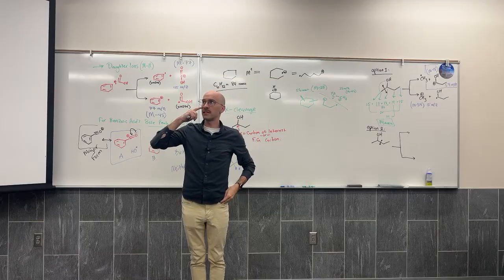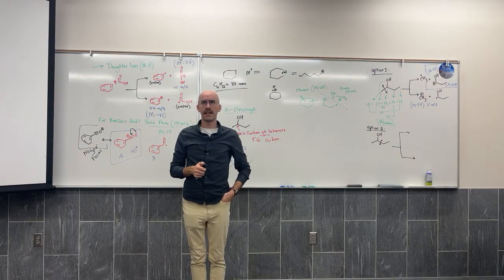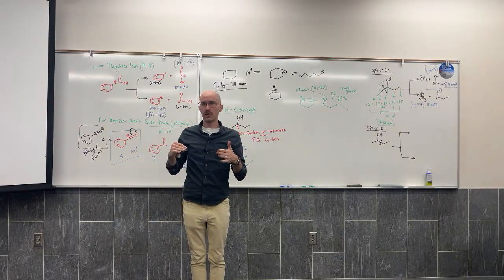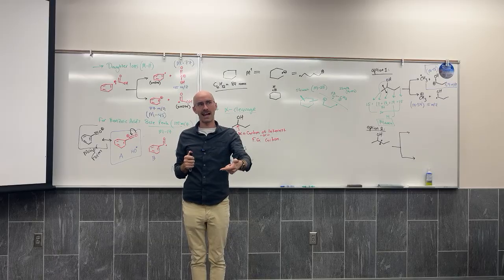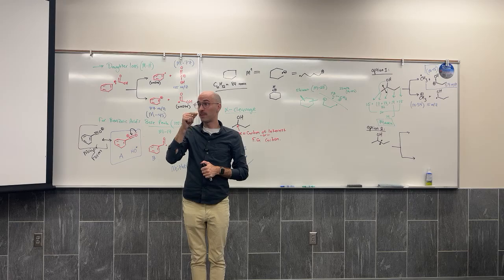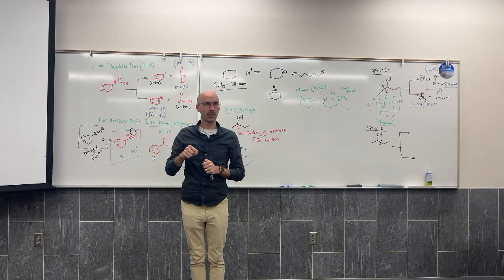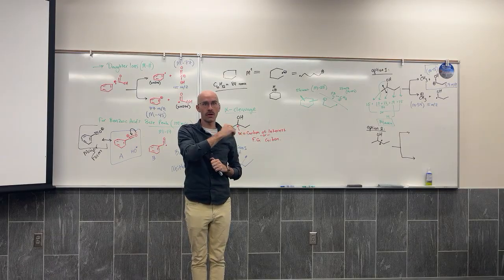There is an additional detail here, which is nitrogens. Nitrogens often bond 3 times, which means that they often have just one extra atom added to the system, one extra hydrogen. I don't know if you guys noticed, all of the structures we looked at so far have even molecular masses: 122, 84, 74.